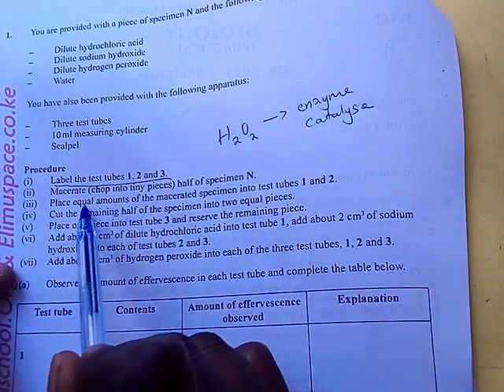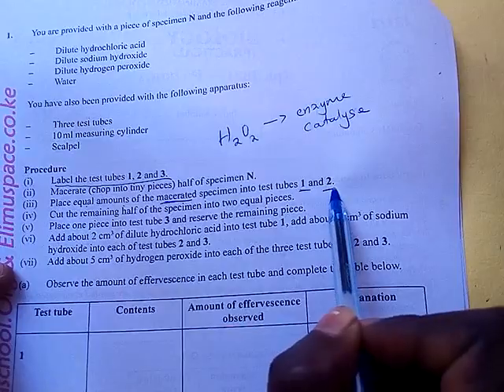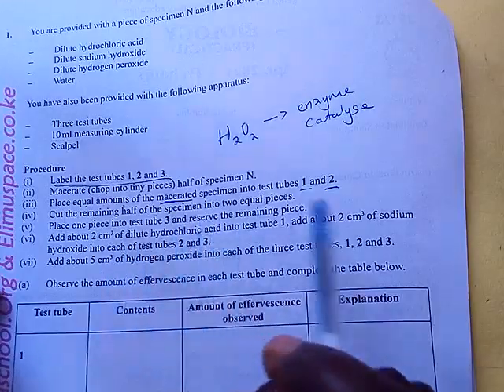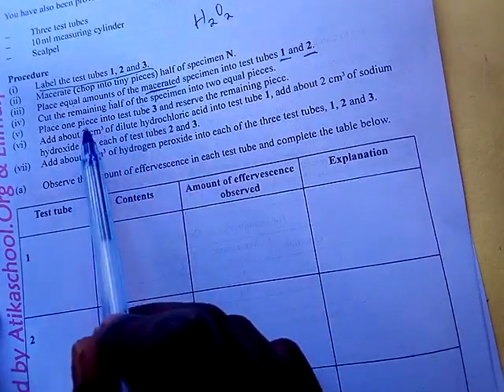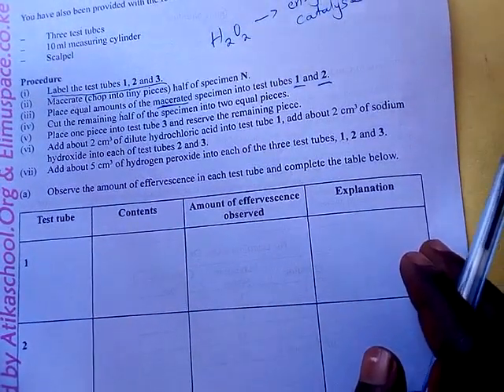Place an equal amount of the pieces of specimen into test tube 1 and 2, and then cut the remaining half of the specimen into 2 equal parts. Let's see the content in test tube 1. You have been told to add about 2 centimeters cubed of dilute HCl.